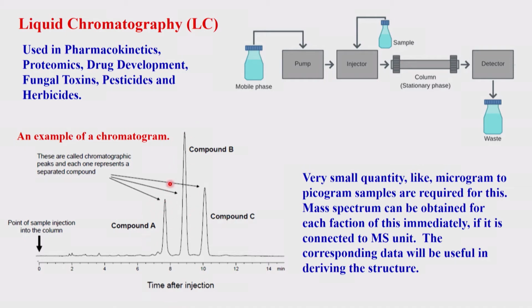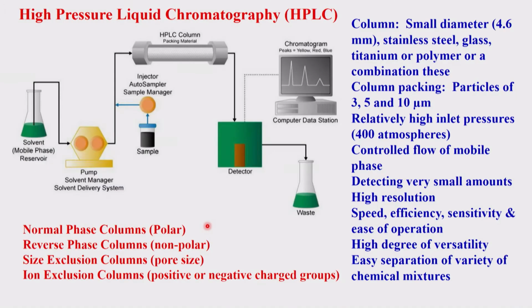Okay. So, you can collect up to here and separate it, you can collect up to these fractions, separate it, you can collect up to these, separate it. That means your separation is over now. So, that is how it is. You can also do the detection part simultaneously. I hope that part is clear. Very simple basic principle of the liquid chromatography.